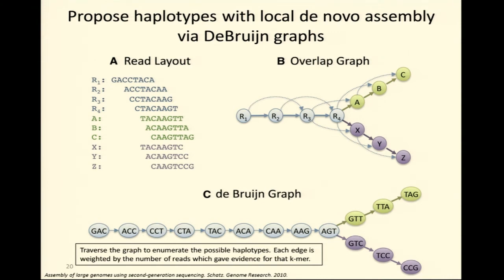Okay, so this is more or less in detail how it works. This graph is a little bit obsolete because we came up with a new way of assembling reads, but in general it gives you the gist of what still goes on. Basically, if you have a pile of reads here, a traditional way of doing assembly is called an overlap graph, in which for each of the reads you compute how much a read overlaps with the others. An alternative approach is the De Bruijn graph, and there's a lot of literature you can consult on how this is done. Many of the newer assemblers work based on this principle.